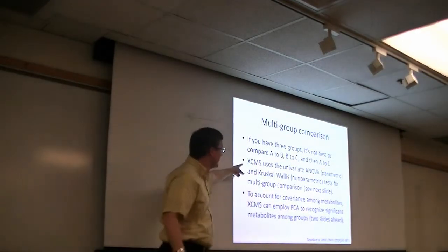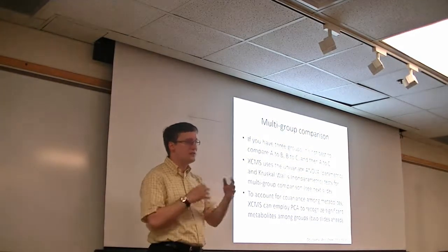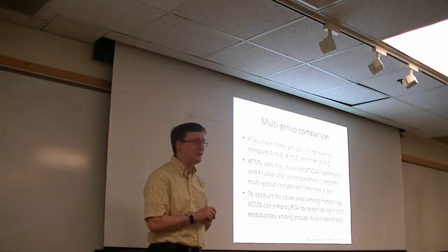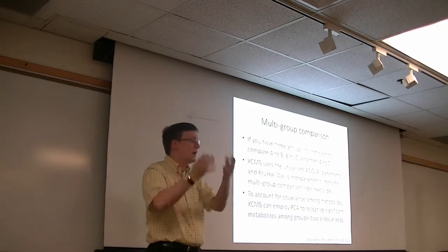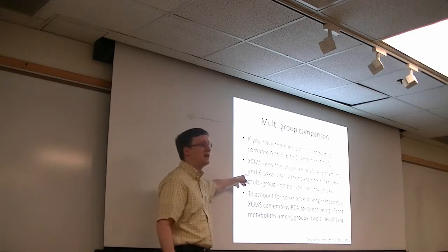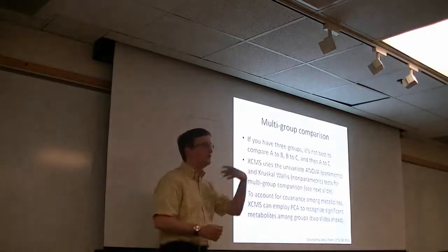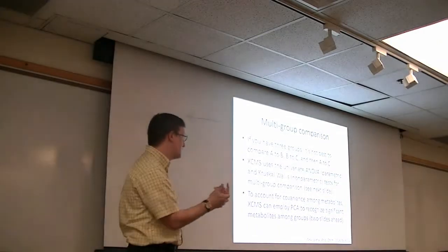Doing it once in an ANOVA test gives you the ability to take these different factors into account. So instead of doing more pairwise tests than you actually have to do, the software will be able to take into account kind of the was seen in A, was seen in B, was seen in C in one swoop instead.